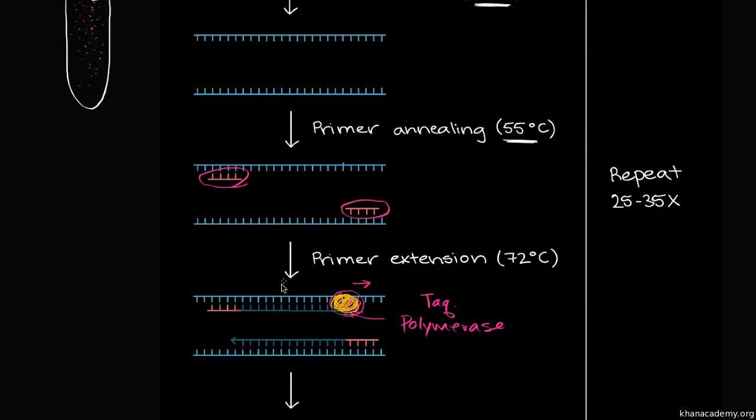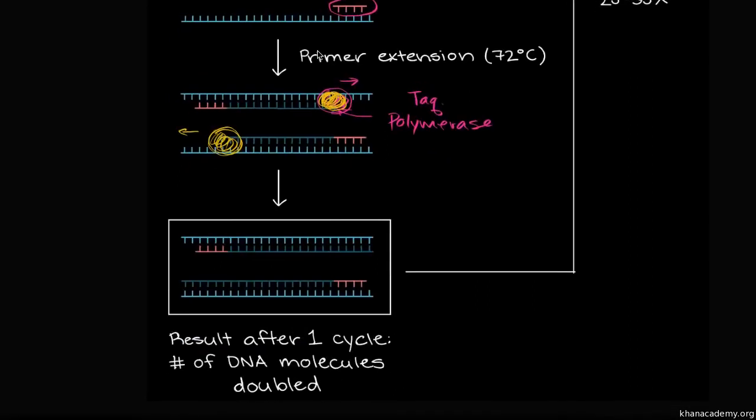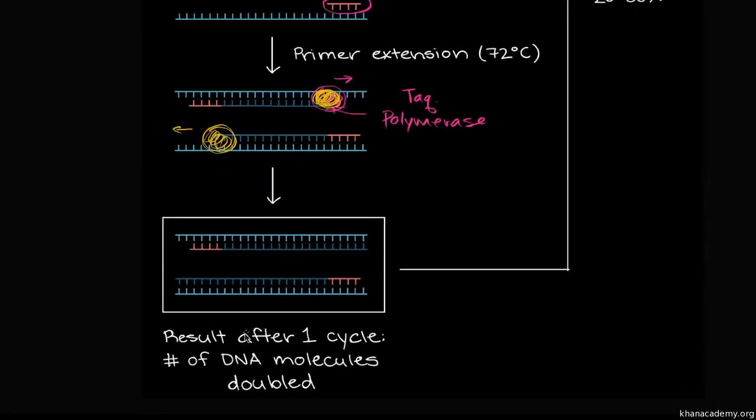And what, do you just wait a certain amount of time? Will it just keep going on forever? It'll keep going on for a while. Usually you do pick the length of that step to match how much time you expect the polymerase to need to complete your fragment. But it kind of will stop. Either it'll fall off or it'll stop when you go on to the next step. Okay. So after one cycle, what you've written here, we would have doubled at least that part of the sequence that we care about. Although we might have copied even beyond that sequence.